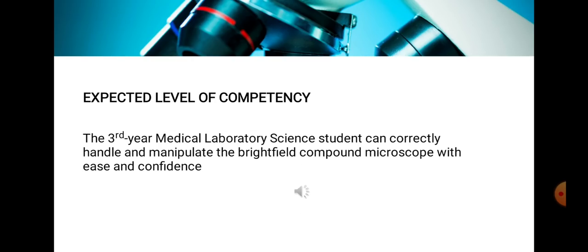As for the expected level of competency, each one of you can correctly handle and manipulate the bright field compound microscope with ease and confidence.